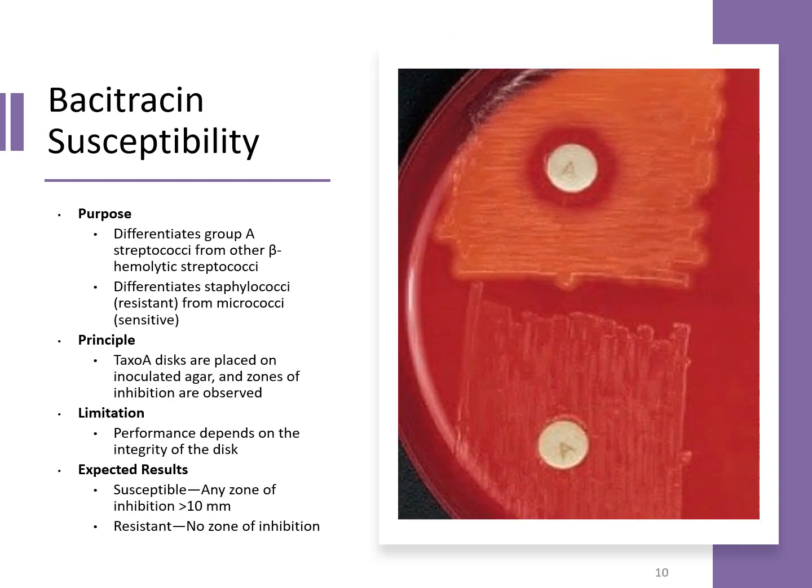Bacitracin susceptibility. With this particular test, you would perform an inoculum of the organism onto the culture plate, and so you would make sure that this organism creates a blanket all over this plate with a lot of growth. So when you culture it, you would use typically a broth suspension, maybe a swab, and you would rub that almost like you were coloring onto that plate or an area of that plate.